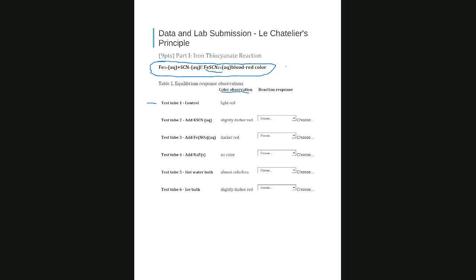So let's look at tube number 2. How are we disturbing the system? Add potassium thiocyanate. Is that a reactant or a product? It's a reactant. Because we are not in the lab and don't need to observe, they tell us it's slightly darker red. What does that mean?